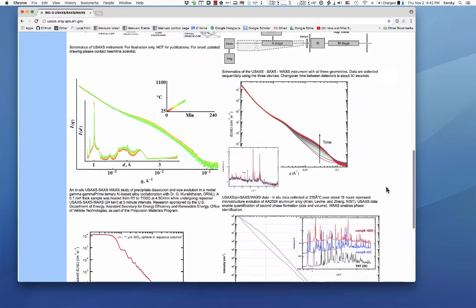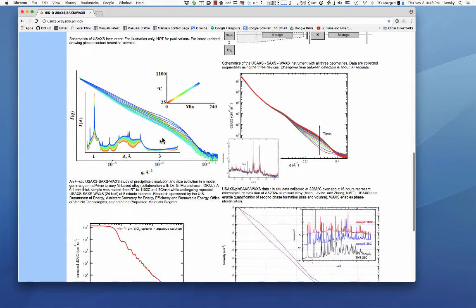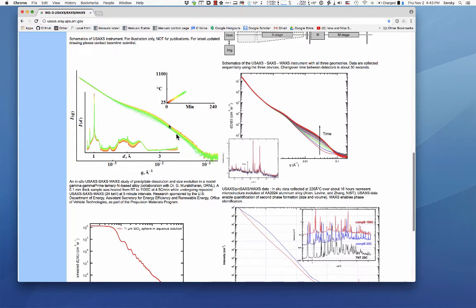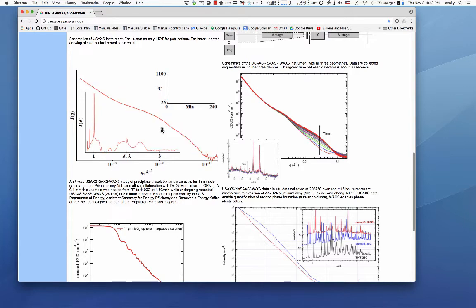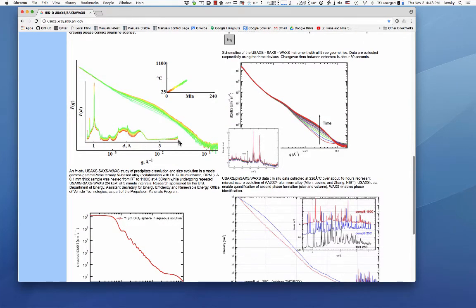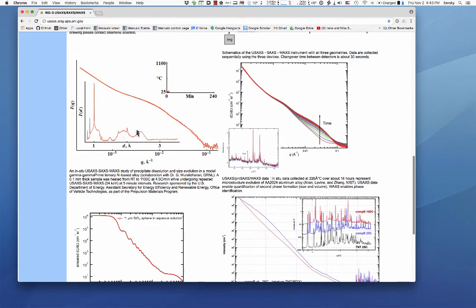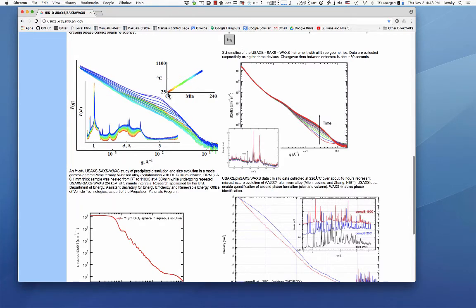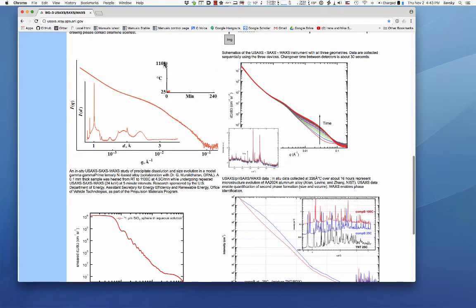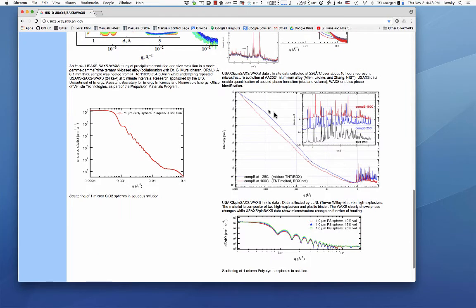Here are some examples. This picture shows ultra small angle scattering data — just the USAXS range — showing how structure changes as a function of time and temperature. The inset contains powder diffraction data showing diffraction peaks as a function of D-spacing. The color scale shows time and temperature dependence: you start at room temperature and over about 240 minutes reach up to 1100 degrees centigrade. Here is another nice combined data set with USAXS, SAXS, and WAXS.